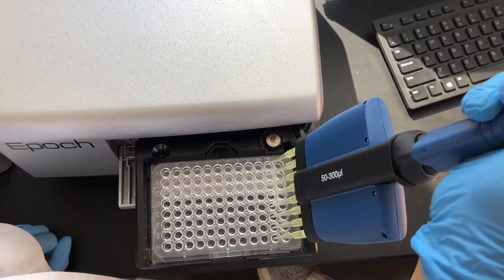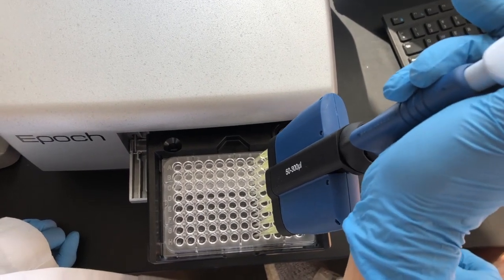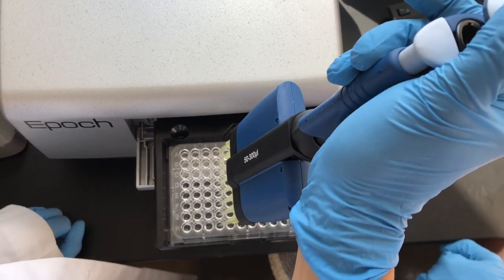I am demonstrating how to pipette quickly from even numbered columns to odd numbered columns. Withdraw liquid from column 10 and dispense it into column 9, and so on.